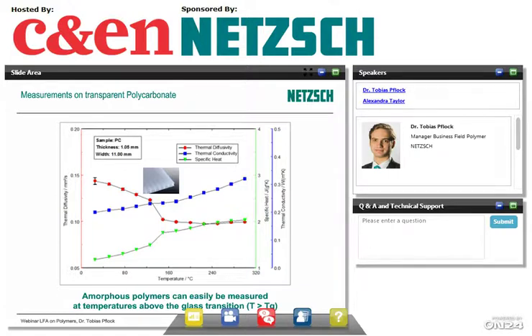On the right hand, you see in light green, specific heat capacity. This can come from either the laser flash method or from differential scanning calorimetry. And together with the density of the material, we can calculate the thermal conductivity. So this gives you the full sketch of the thermophysical or thermal transport properties of your material, and we end up with this blue signal here as thermal conductivity.